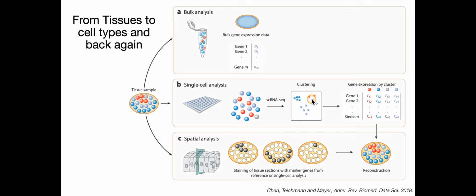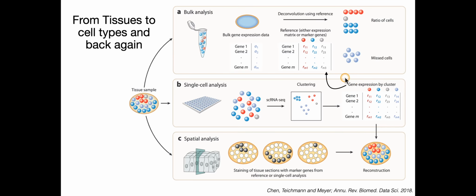So, for example, in a single cell experiment, when we identify transcripts or genes unique to a specific cell type, we can use that information to inform our bulk RNA-seq analysis. And this is actually a really powerful thing that you can do. You can take single cell data to take a bulk RNA-seq data set and deconvolve it to try to understand the kinds of cells that might be generating your bulk RNA-seq data. Is it primarily CD4s or CD8s? What the relative contribution of different cell types might be to that bulk data.